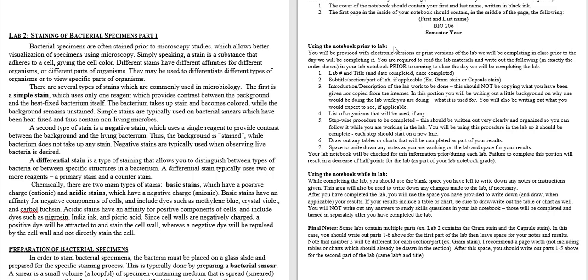A second reason is because at the end of the semester, you're going to have your lab unknowns. Your unknown project is just that. You're going to be given an agar plate and a broth, and you're going to have to identify what that is. So your lab notebook is what you will be taking with you into the classroom when you're doing your unknowns. So anything that you write down in your lab notebook for how to do a procedure, any notes, anything, is what you'll have available to you when you are doing your unknowns.